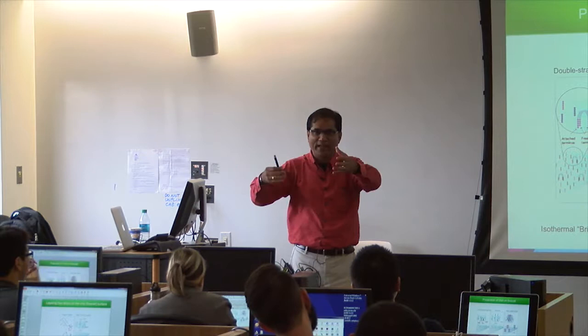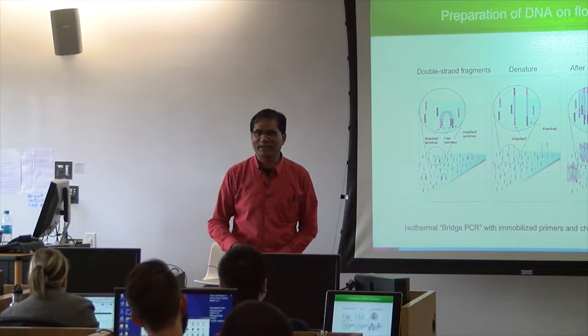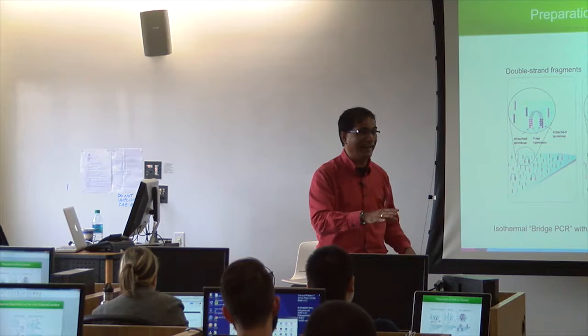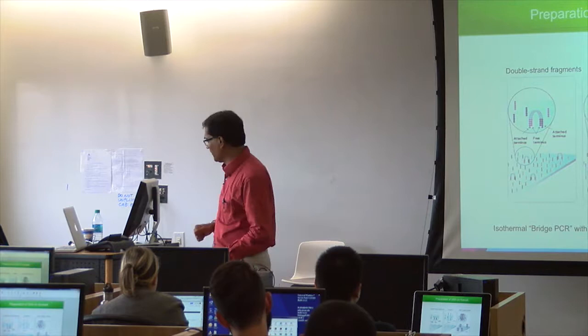From that, if you're extracting 350 million, statistically, you are representing the entire human genome by several fold, several x. That will take another half an hour class to explain all those numbers. And that also tells you, you must have heard, PCR duplicate, right? Those numbers will help you understand what exactly a PCR duplicate is. But that is a different topic. Some other time when we meet, we can discuss that.